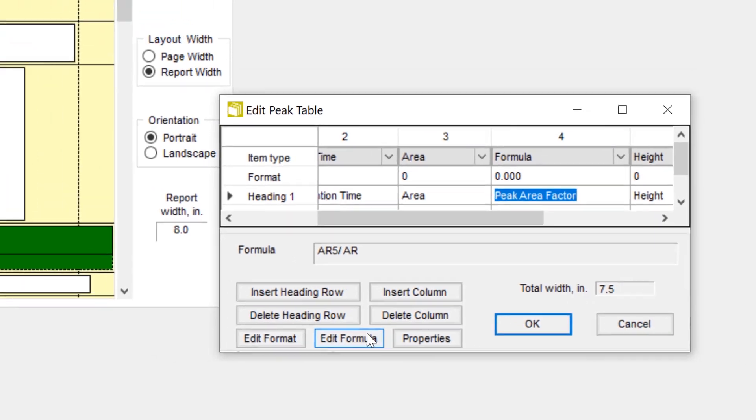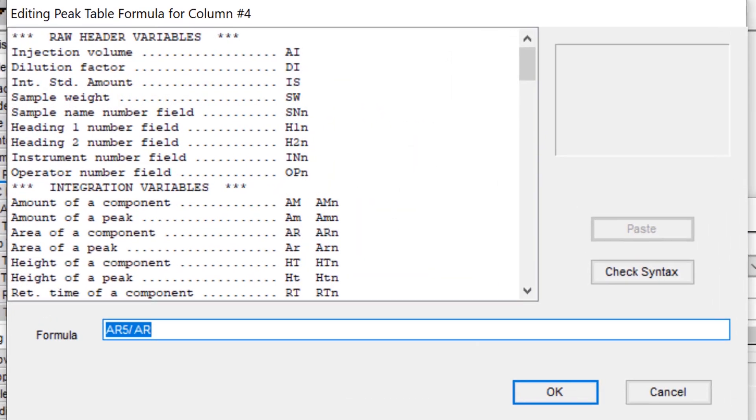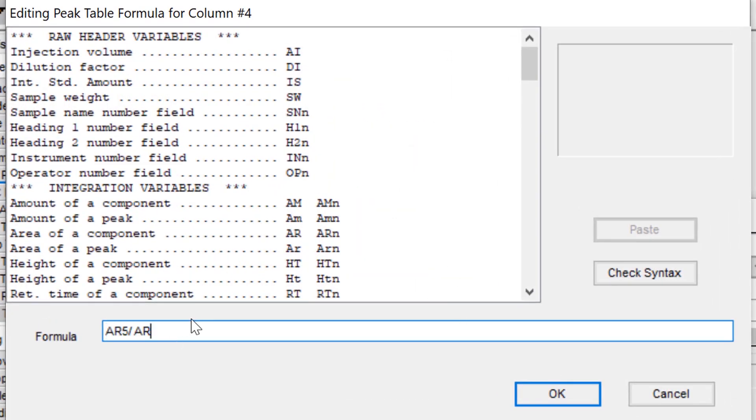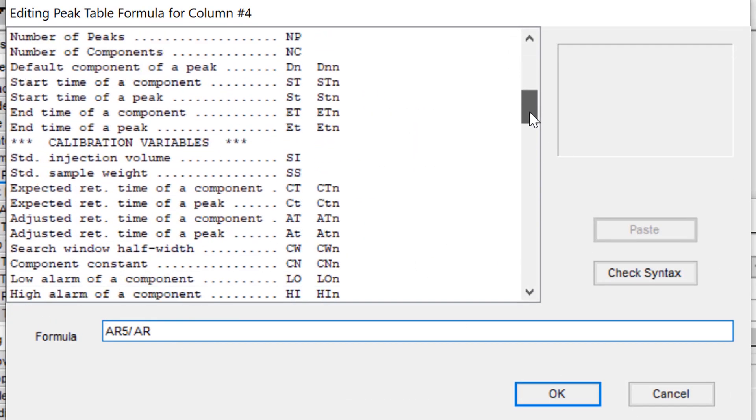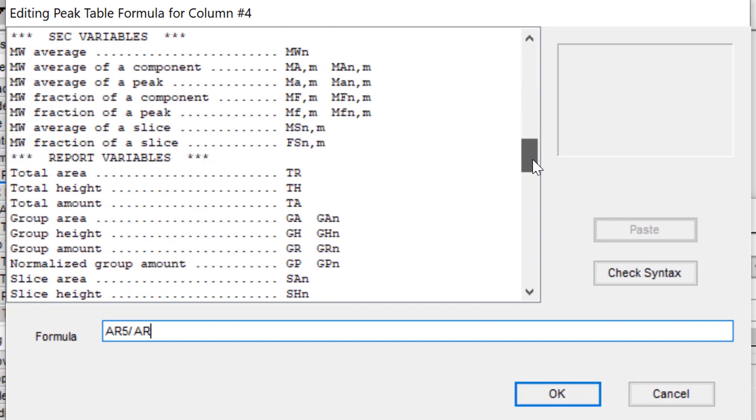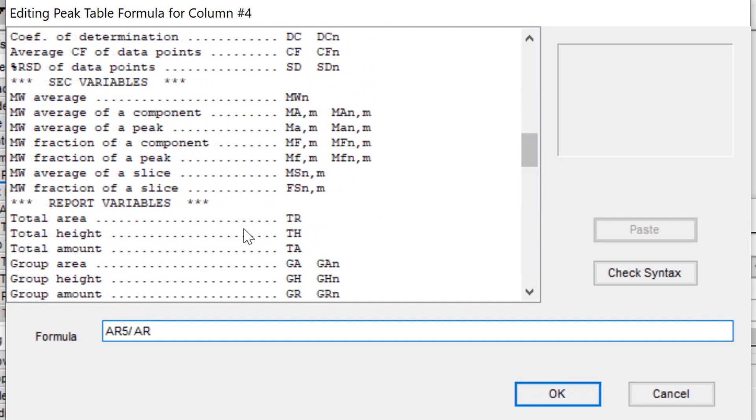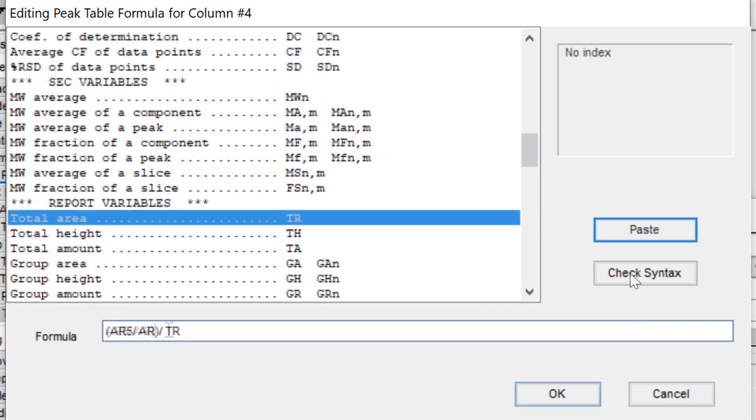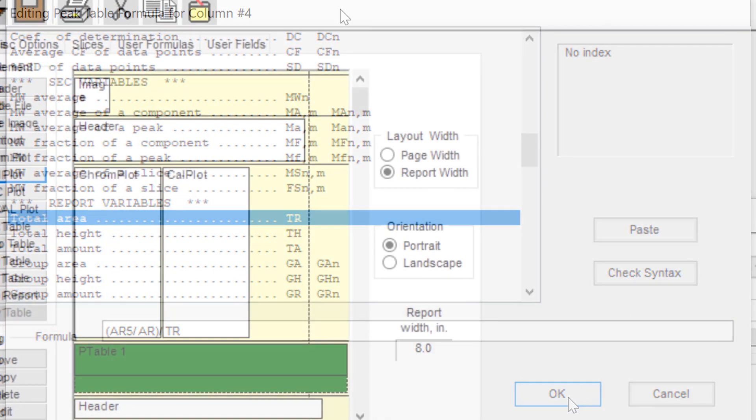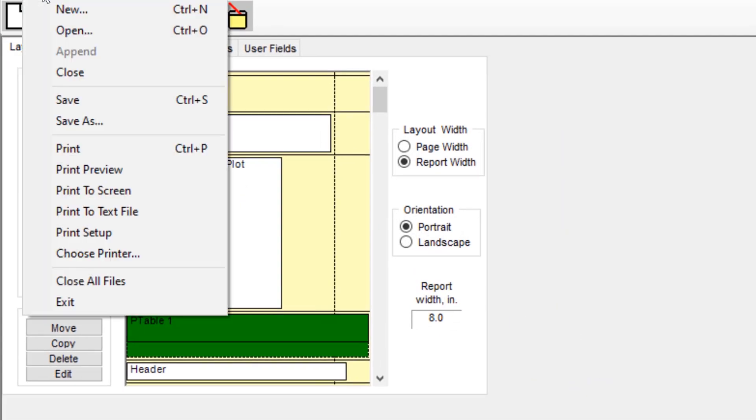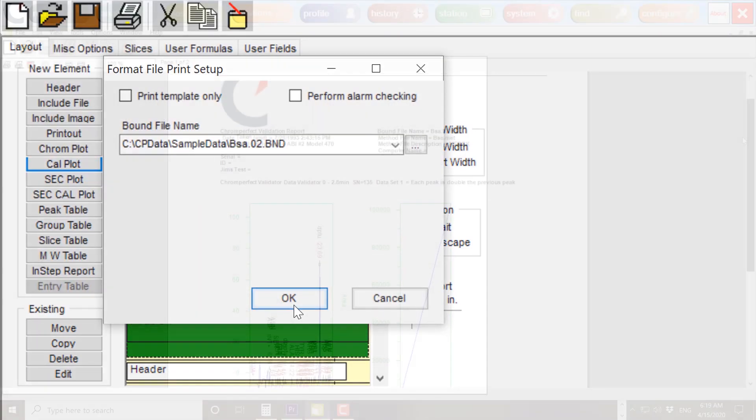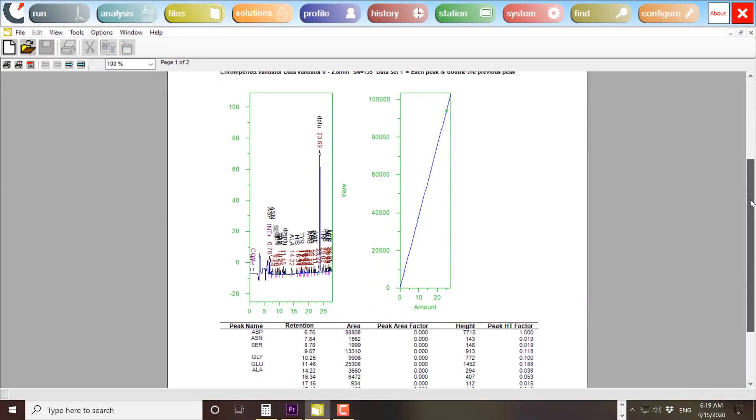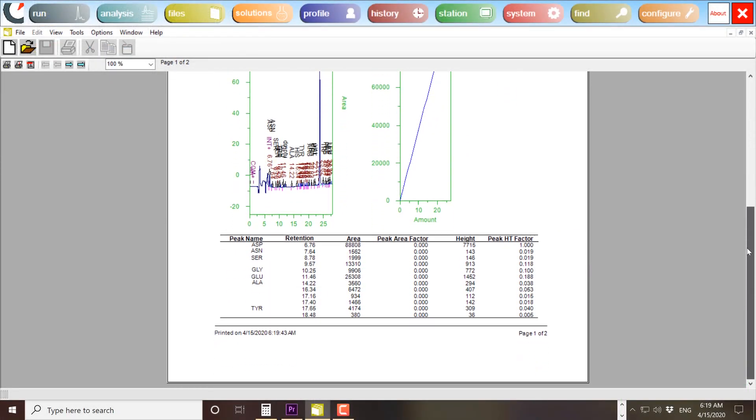At the heart of ChromePerfect reporting is the powerful formula and alarm editors. These allow complex calculations and alerts to be embedded for automated production and QC processes. Once a report template has been designed, it can be instantly shared across the organization.